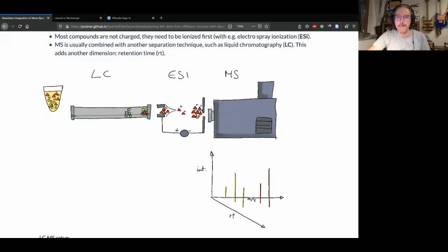So people are responding. For the moment, 69% said yes, 31% said no. Okay, so we still have some people that don't know mass spec. That's great. It makes sense that I give you a very basic introduction to that.